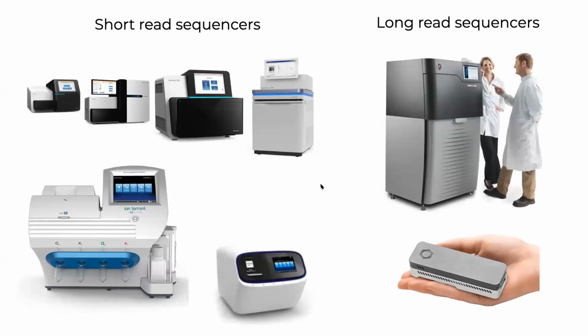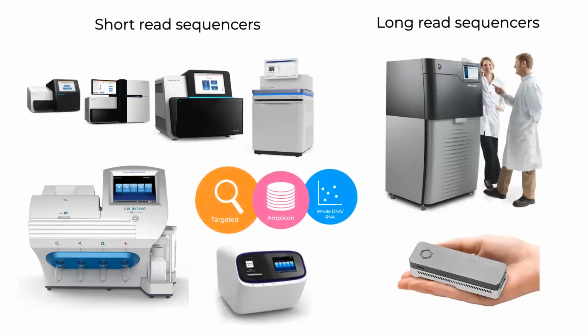So there are also many different types of sequencers that are not just Illumina sequencing, and those could be used for a variety of applications. For example, Oxford Nanopore is very affordable and produces long sequencing reads, which could be a very beneficial way to detect full genomes and assemble short reads into genomes. A lot of times that's also useful to detect very high frequency mutations, but if we want to get greater detail, that's going to be limiting because the accuracy of each position is not so great.